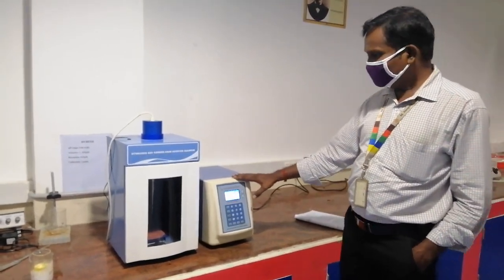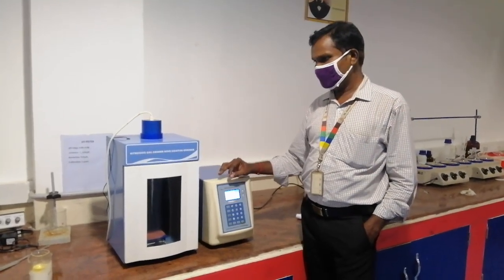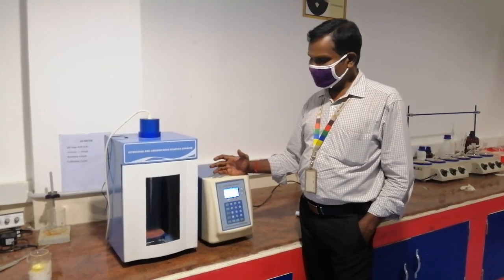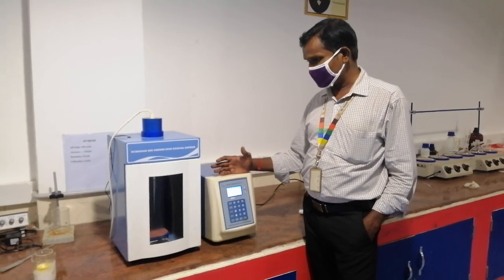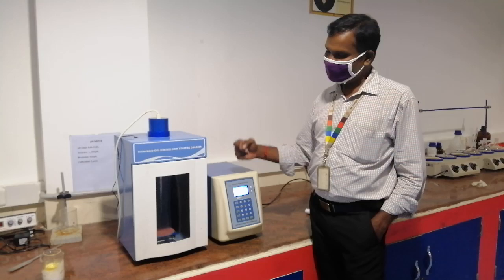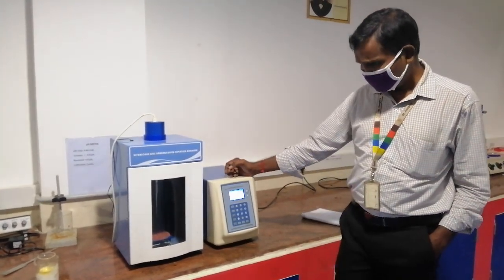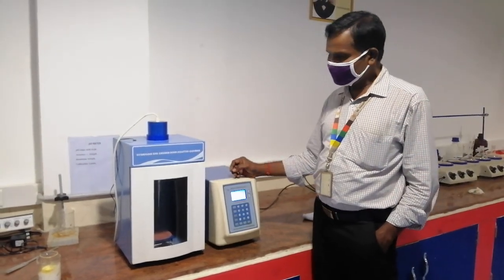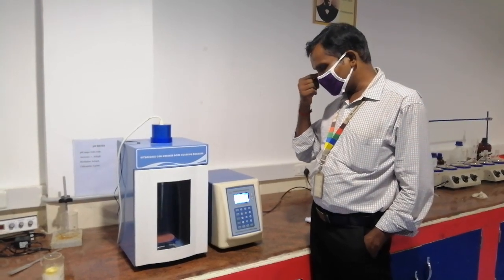Okay. So here we are going to disrupt the same sample again and again for different times. So here time is going to be the variable. So disrupt your cell slurry, say for example for 30 seconds. After 30 seconds, you take 0.5 ml or 1 ml of the disrupted cell slurry. Centrifuge the cell slurry and find the concentration of protein present in your sample by using Bradford assay.